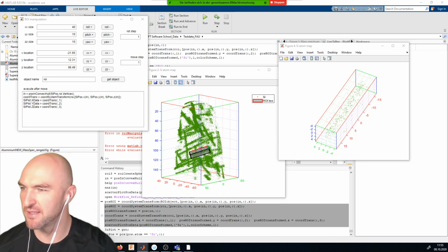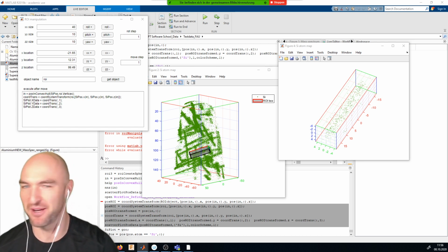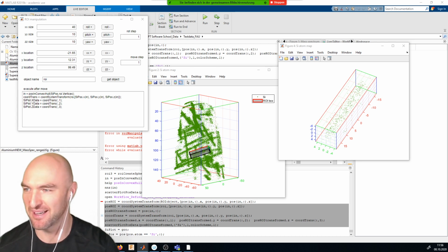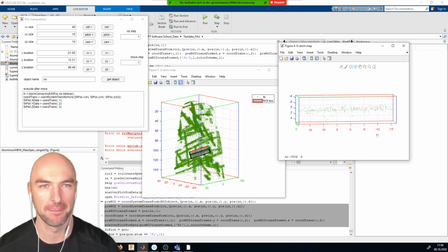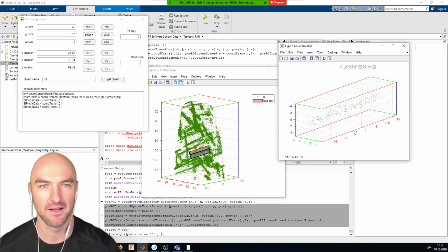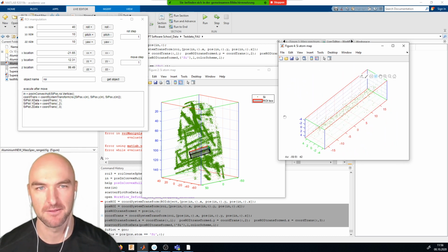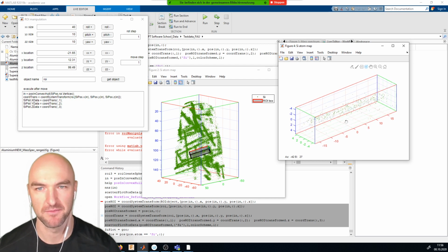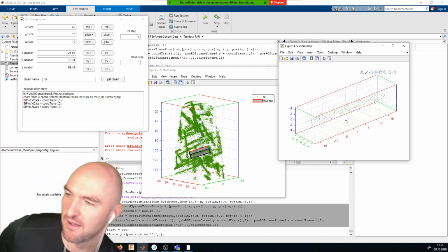What do you mean by SVD? So Andy, don't be afraid to say something. Don't be afraid to switch on your microphone and talk to us. It's singular value decomposition. Okay. Yeah, so you do a principal component. Yeah, it's your go-to fitting thing. If you've got an oblate spheroid, you find the principal axis of it.